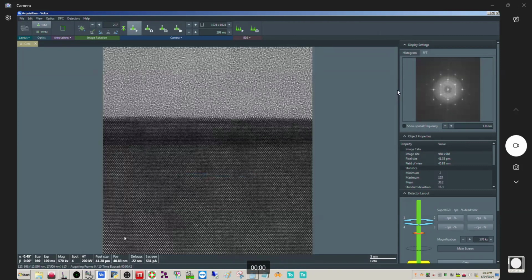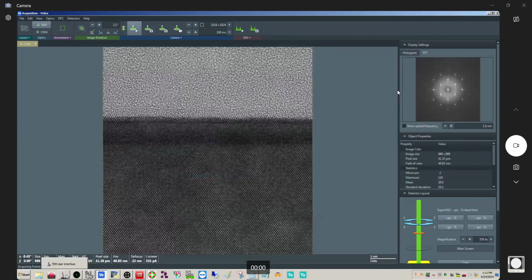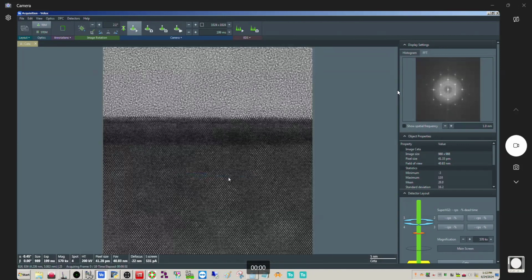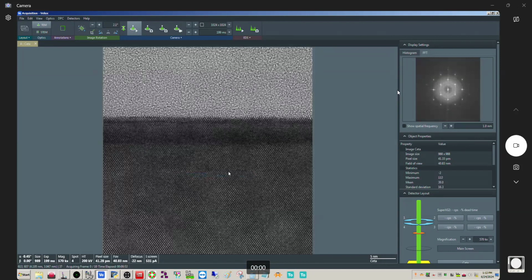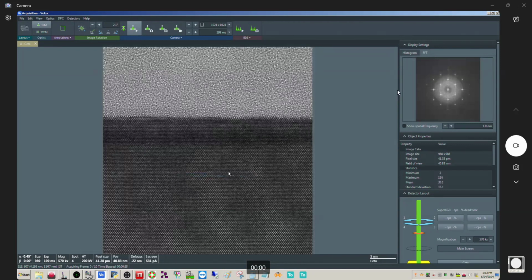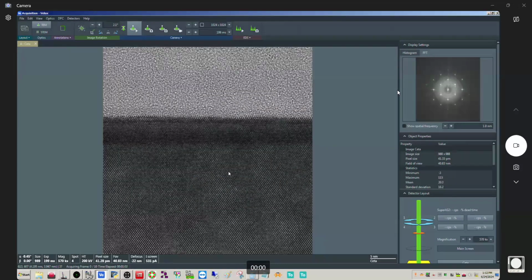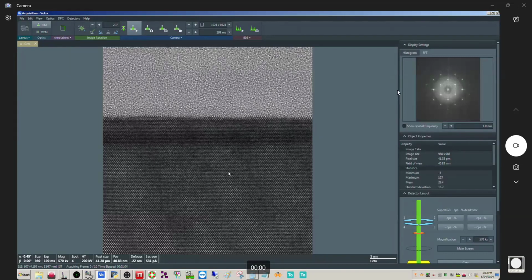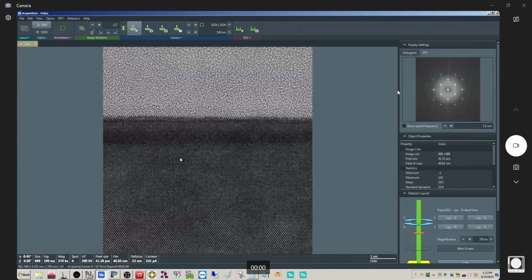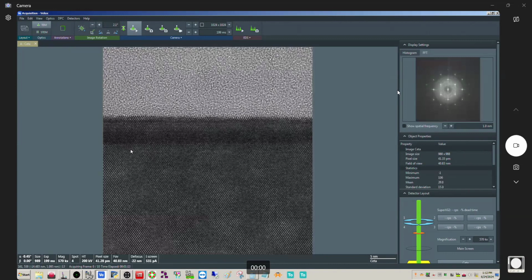Okay, so that is how to perform coma-free axis alignment. Now, in principle, this is going to get you the best quality high-res image possible. Okay, better than just doing normal rotation center. Okay, how much of a difference? I don't know if you'd really be able to tell, all of the factors being the same, like if you had a decent sample to begin with. But in principle, this is what you have to do to get the best possible performance, at least when you're doing conventional high-res imaging. Okay.